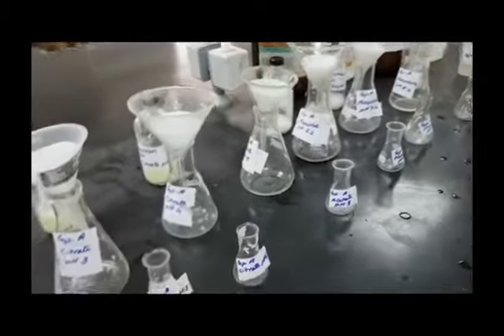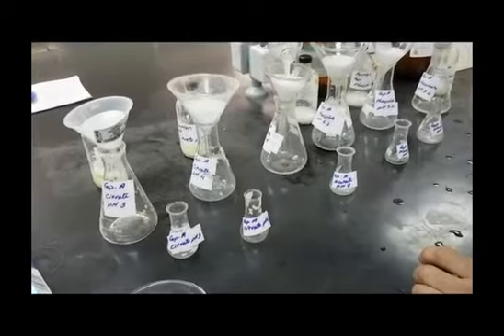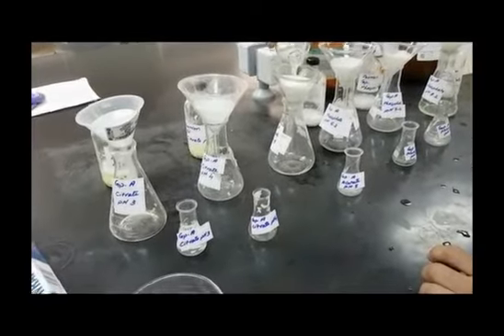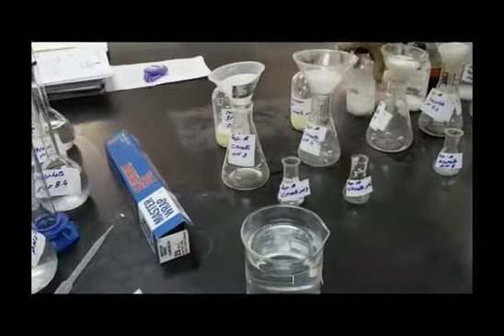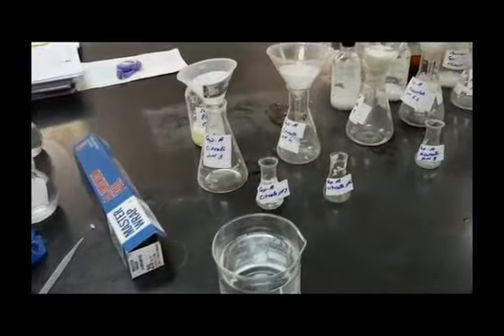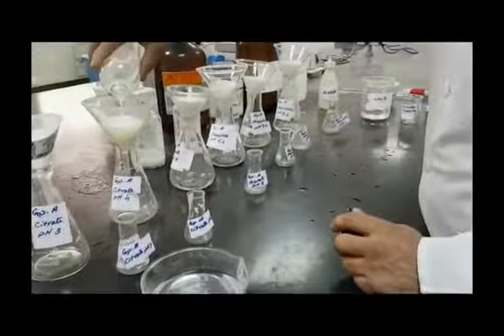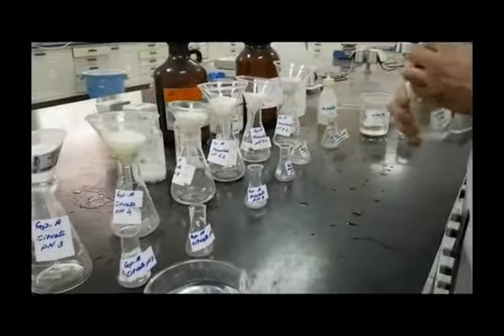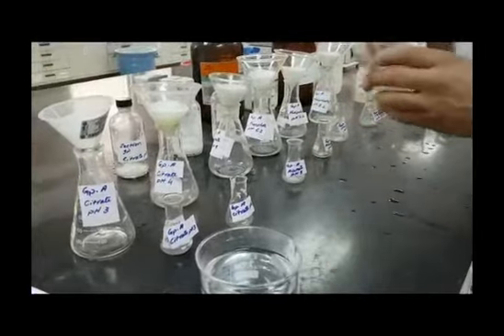Turbid filtrates are problematic, whatever the reason they form, as the filtrates will have undissolved solute, and this will lead upon dilution to overestimated solubilities, higher than the real solute solubility.